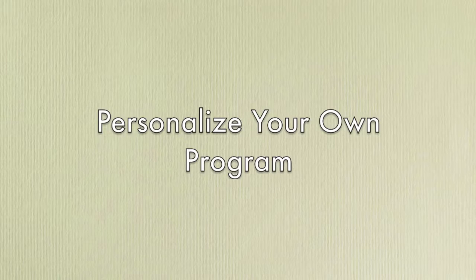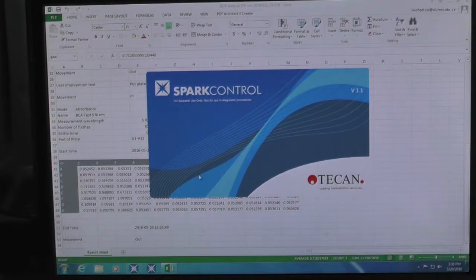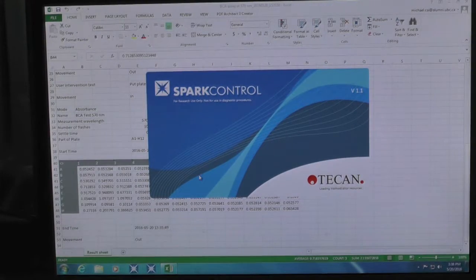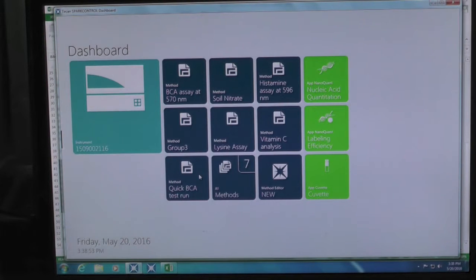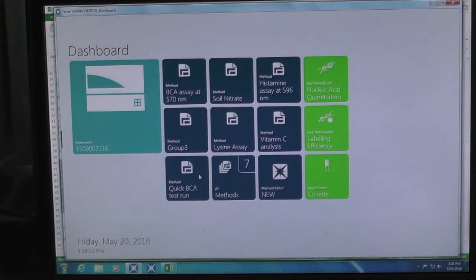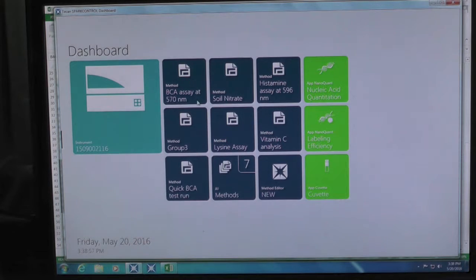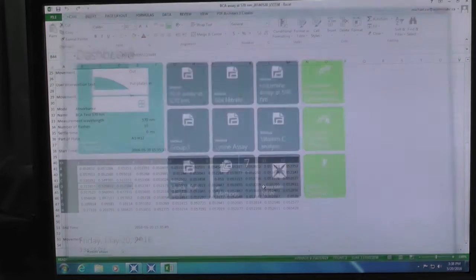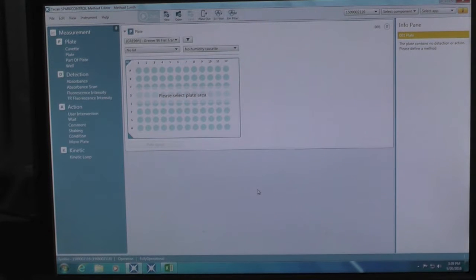Personalize your own program. To set up your assay for particular research need, click on Spark control icon on the task bar to initiate the program. On the dashboard, click Method Editor New. You will come to the Method Editor screen to set up your method.